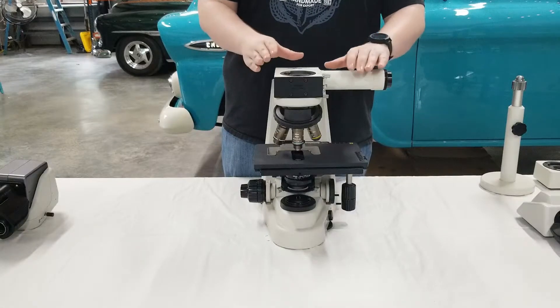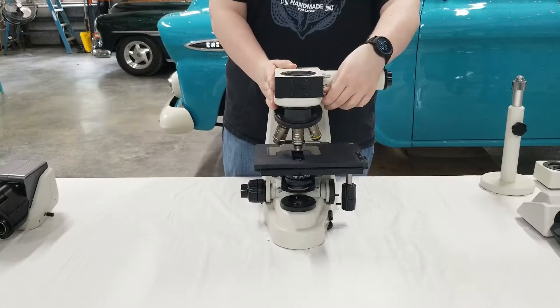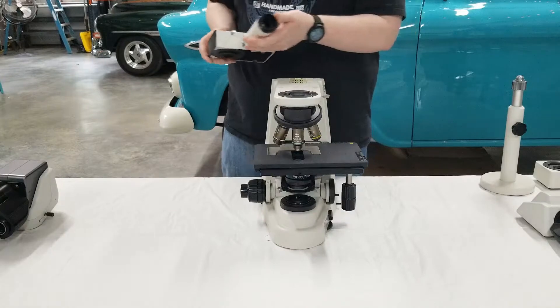The third step of this process is to go ahead and remove the illumination section, or the pointer section. You're going to go ahead and loosen up the lower silver screw until you get a little play in it. Then you can just simply lift it off and place it to the side.